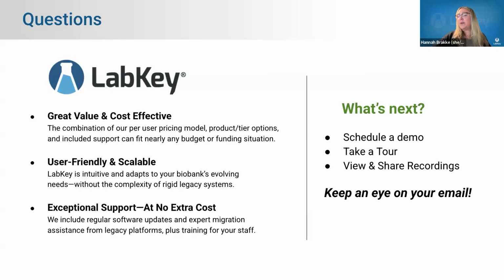Okay, great. So one of the first questions is, can we make adjustments to the sample descriptors over time, or are they fixed? It really is flexible over time. You can continue to add sample descriptors, add other drop-down options to those text choices, or layer on those validators as needed.